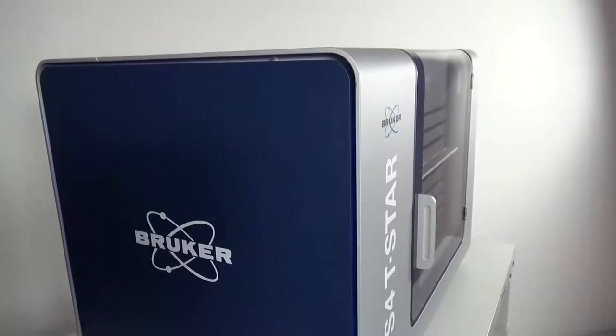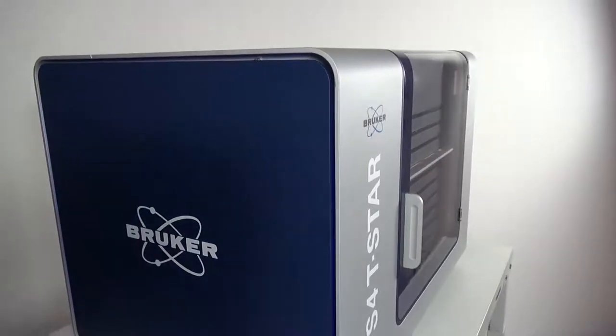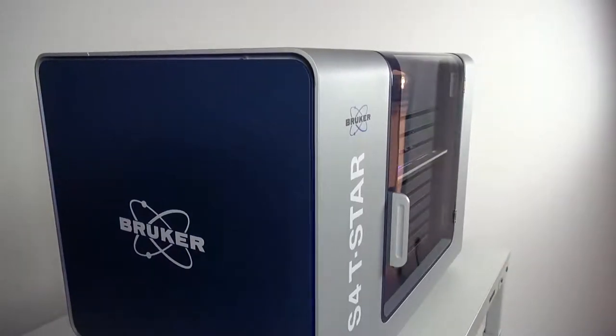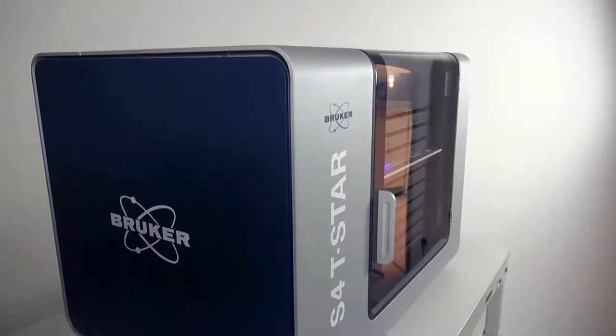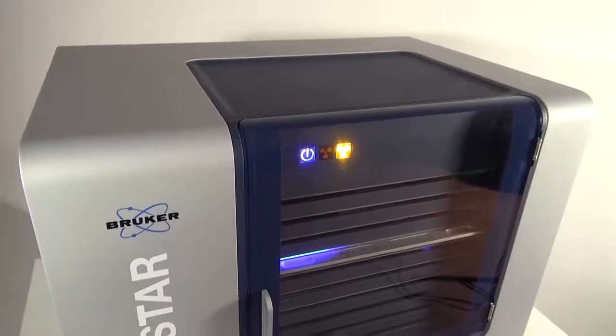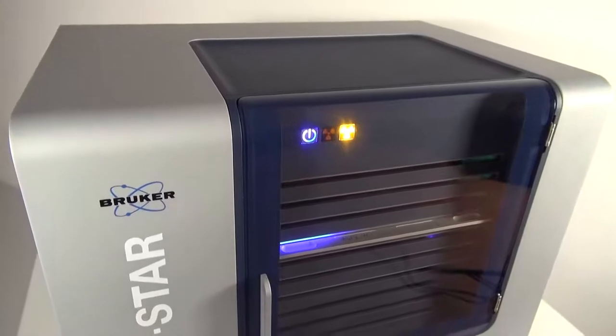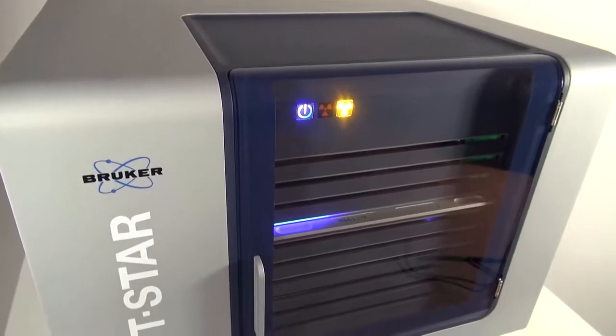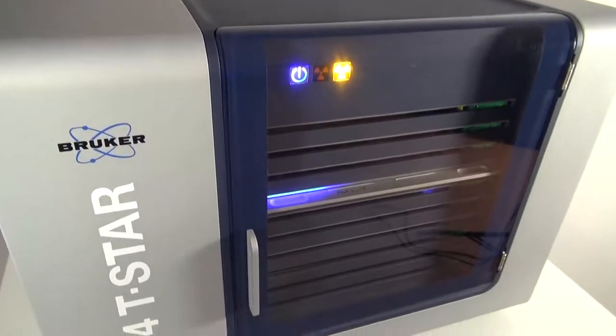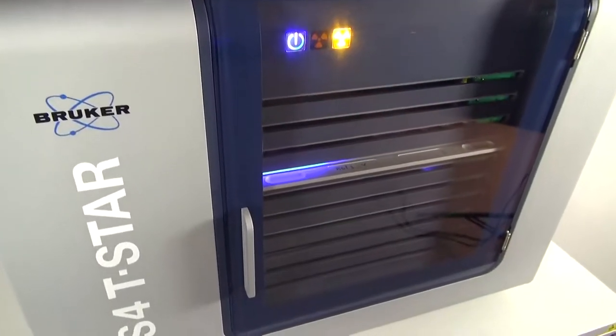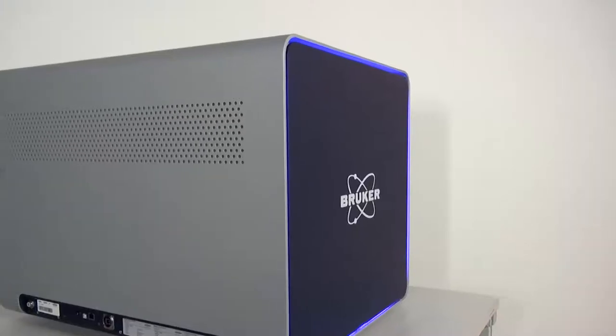The S4 TSTAR is a unique total reflection X-ray fluorescent spectrometer. It is developed for ultra-trace element analysis in a broad range of application fields.